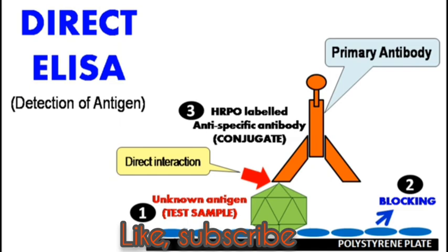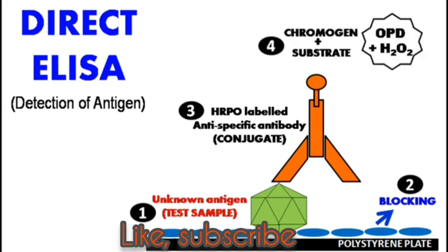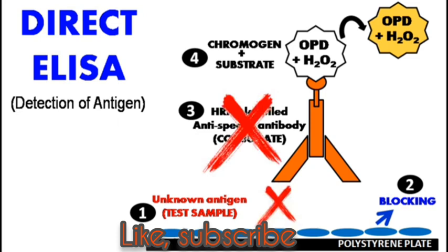Following addition of this conjugated primary antibody, incubation and washing, subsequently the substrate plus chromogen mixture is added. This mixture, due to the catalytic reaction mediated by this HRPO enzyme, turns the colorless OPD chromogen to color. The color development indicates the positivity of this cascade of reaction, which happens only if the sample is positive for the particular antigen. In contrast, if the sample is negative for the specific antigen, this conjugated primary antibody will not have the opportunity to interact with the antigen.